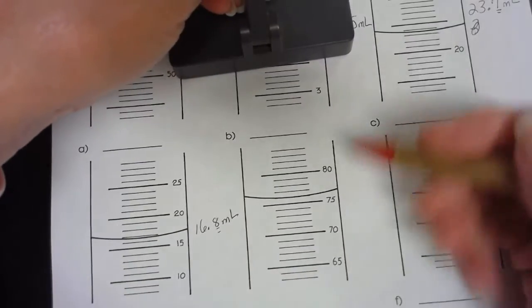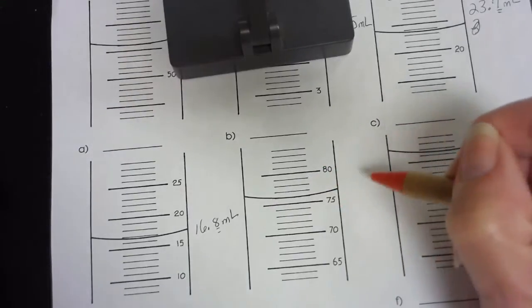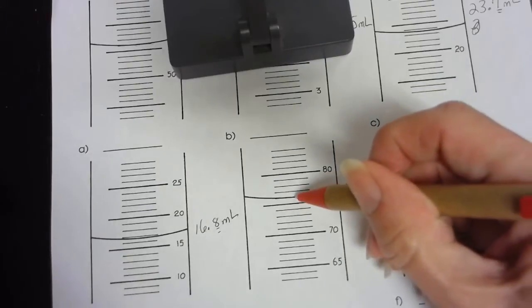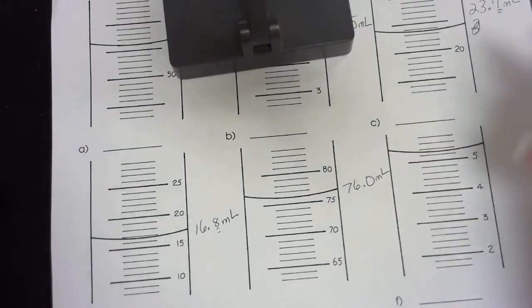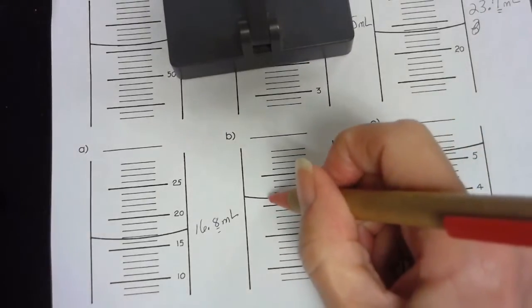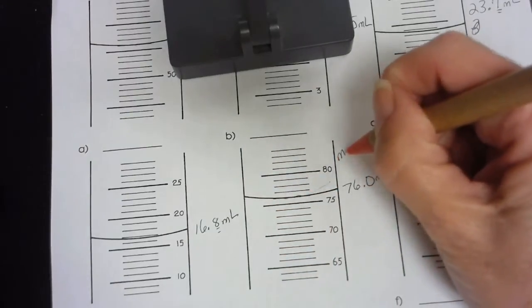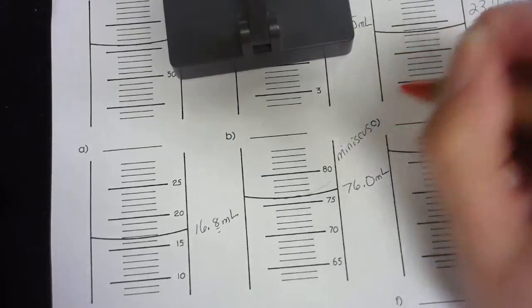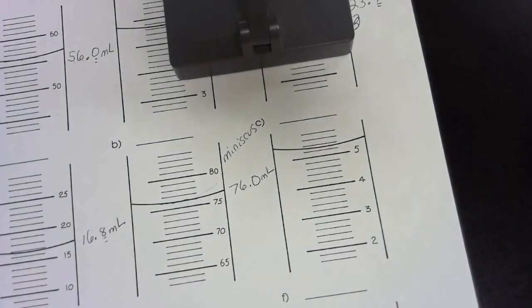All right, this one is 75, 76, 77, 78, 79, 80. Okay, so this is going to be 76, and it really looks to me like it's on the zero. Okay, so 76.0 milliliters. And by the way, I don't know that I've told you this or not, but this little dip here is called a meniscus. I don't know how you spell it, but that's how you pronounce it, meniscus. Okay, too early in the morning to be figuring that spelling part out.